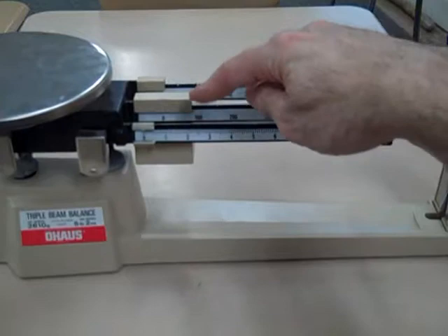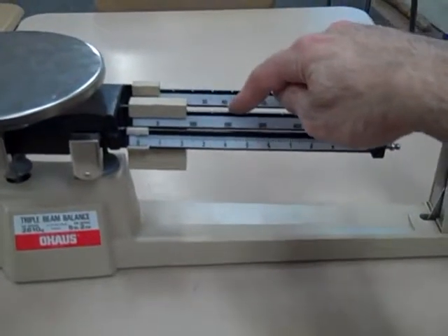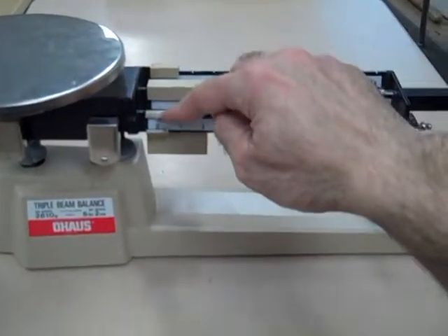Our triple beam balance has three denominations. It goes by one-hundreds, tens, and ones.